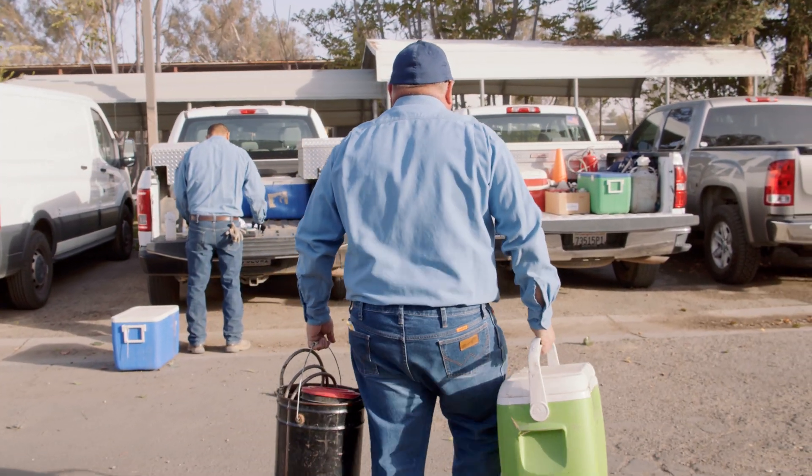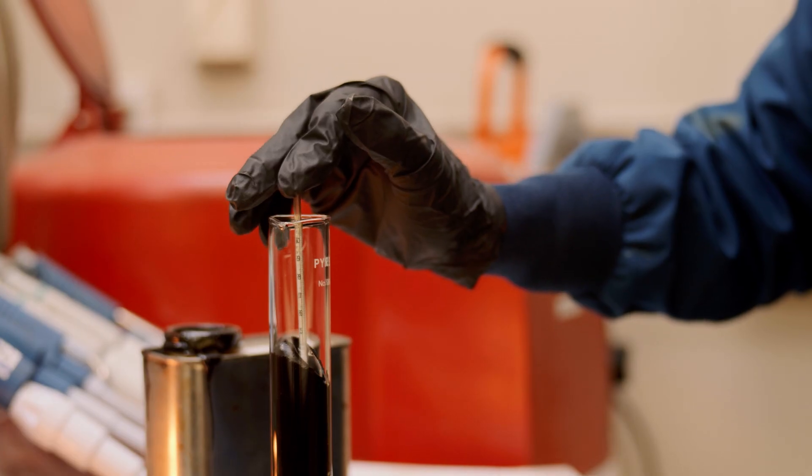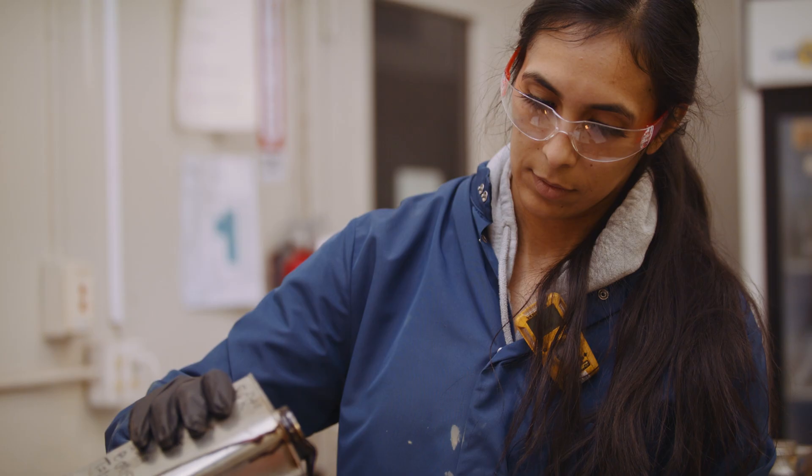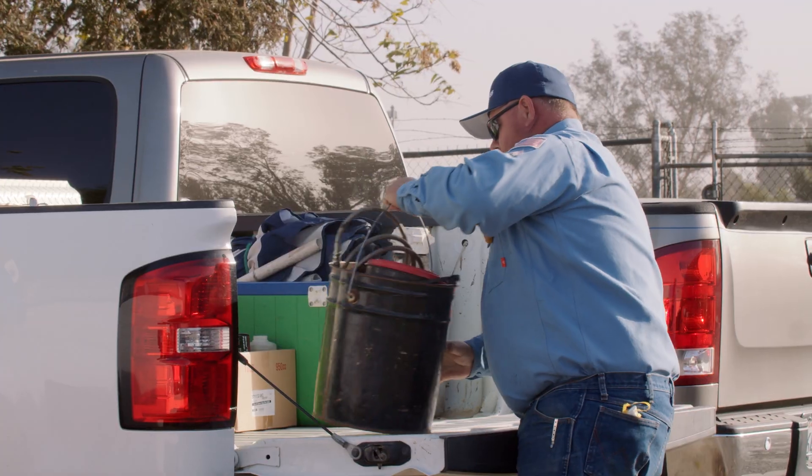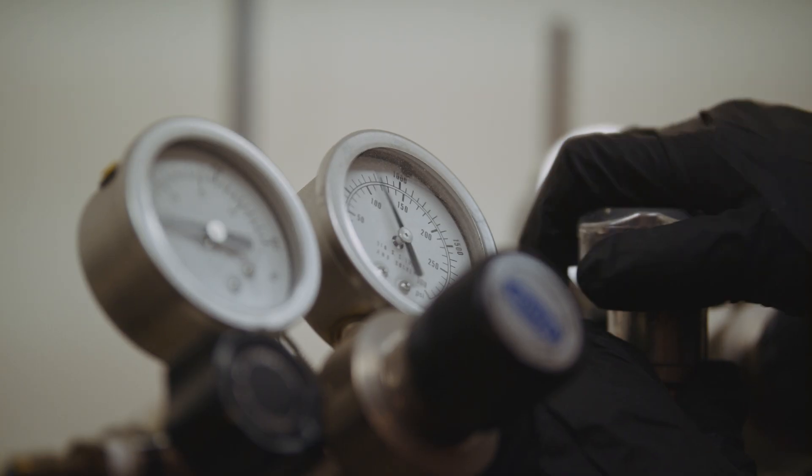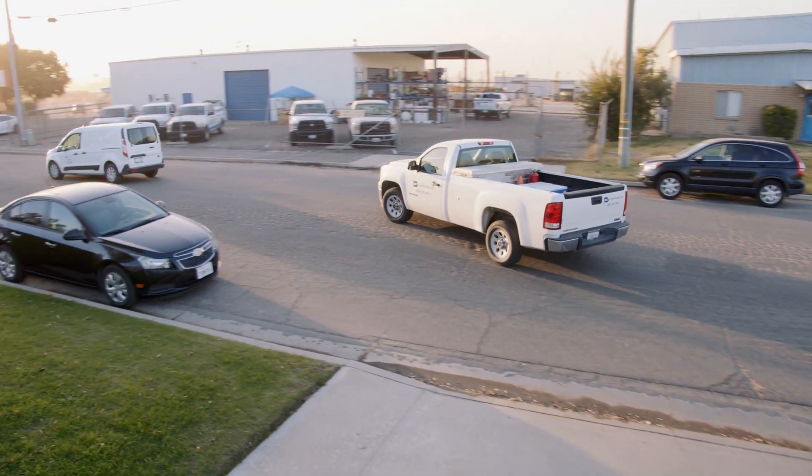California produces a lot of oil and a lot of water. BC Labs is proud to support California's oil and gas industry. Our petroleum group is comprised of analysts, field service technicians, and dedicated project managers, who are familiar with California's strict environmental regulations.